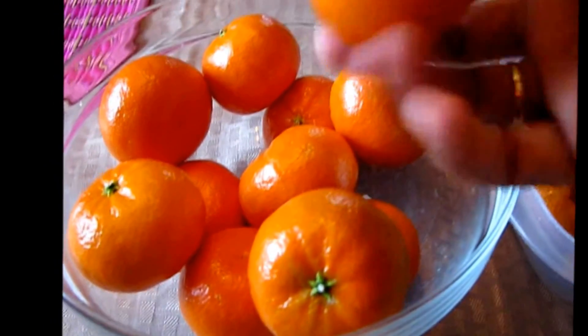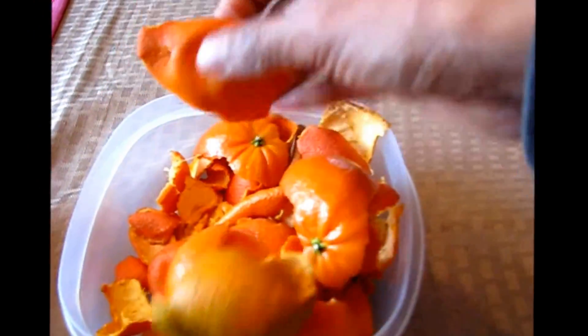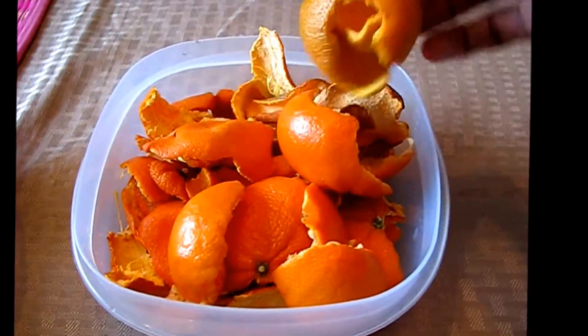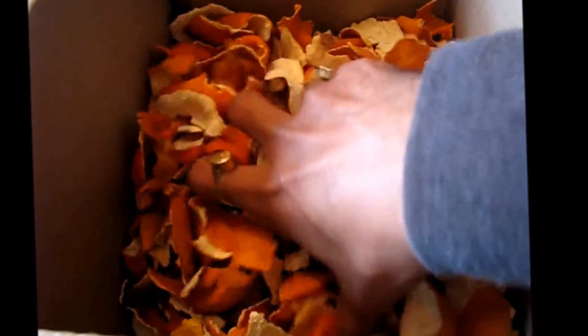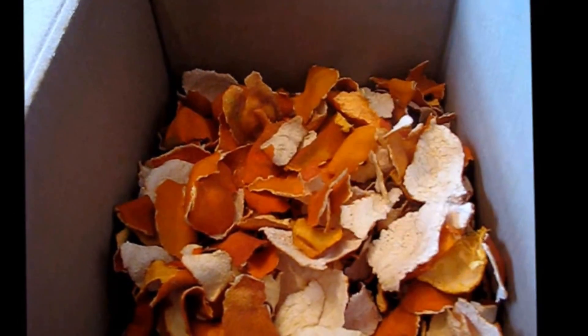I'm using these small oranges. I have collected some fresh peelings, and others are one or two days old. They are all kept in shade, not in the sun. I have also collected some more here — I've been drying these orange peelings for about one and a half months, all dried in shade without any sun. I weighed all of these and they are a little over half a kilogram.